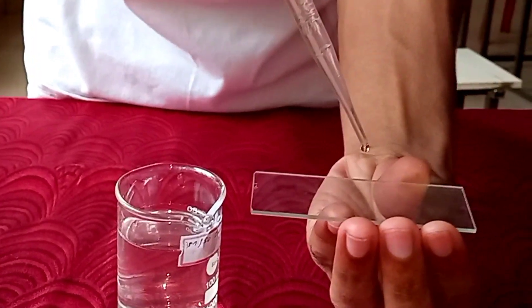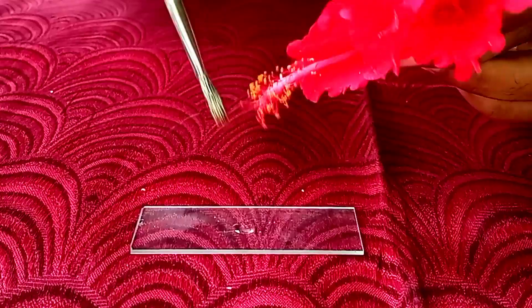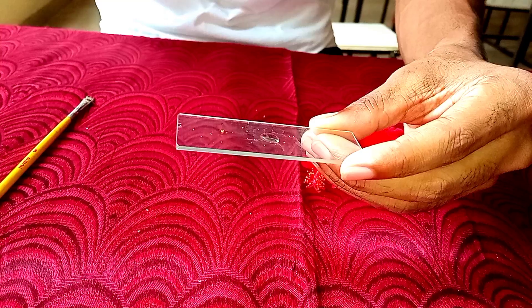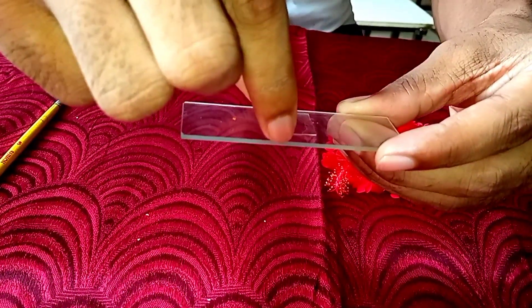Step number two: put a drop of pollen germinating medium over the slide with the help of a dropper. Step number three: dust the pollen grain on the medium with the help of a drawing brush.